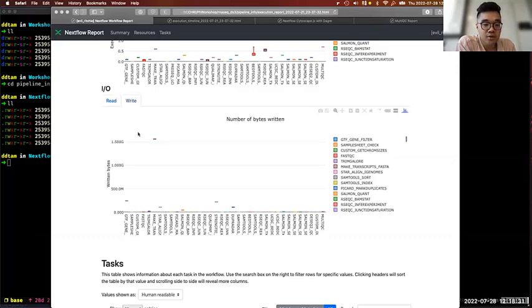Similarly, it should... oh, it doesn't actually write much, I guess because the BAMs are quite small. But if you had an actual full library, this should be quite large because this will probably correlate pretty well to the size of your BAM.